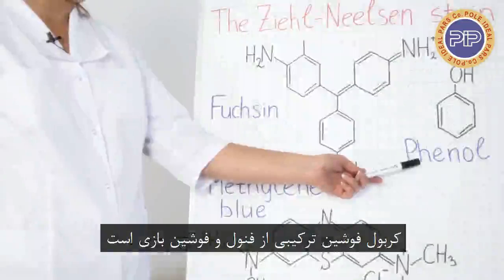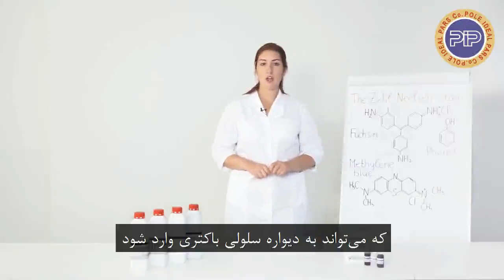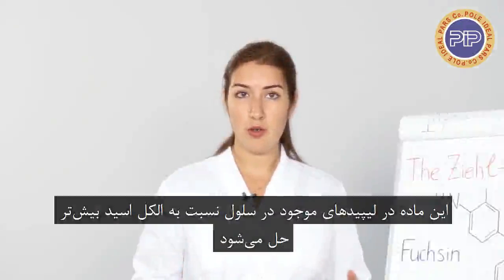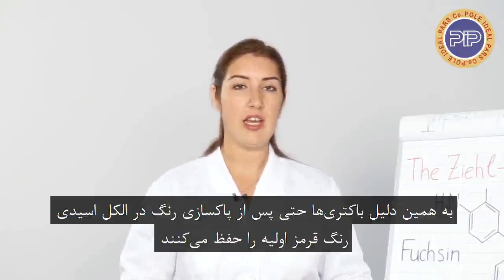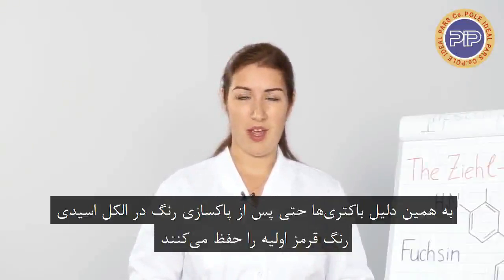Carbofuchsin is a mixture of phenol and basic fuchsin. It has an affinity to mycolic acids from the bacteria cell wall. It is more soluble in these cell lipids than in acid alcohol. That's why the bacteria will retain the initial red color even after destaining in acid alcohol.